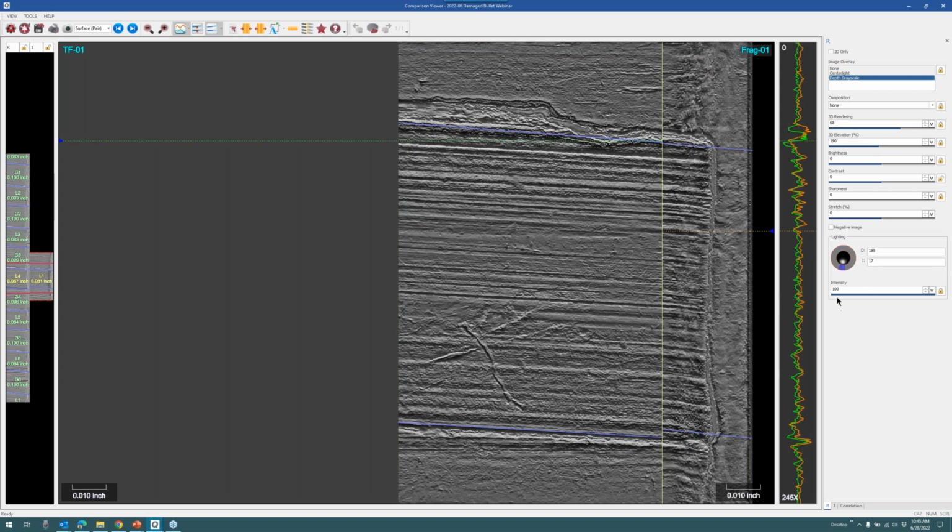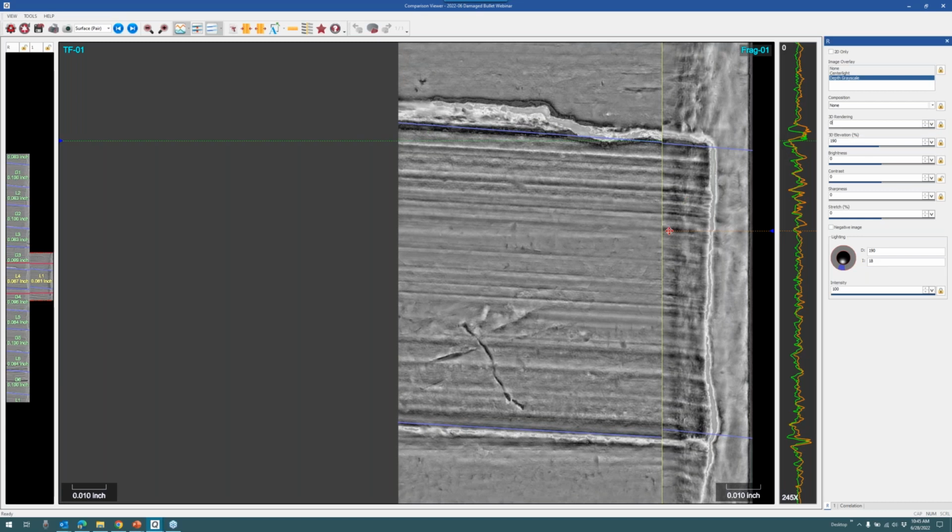see it. But when it comes down to how the system is working, if I go back to this 3D rendering tool here, bring it all the way back down to 0 for that raw depth grayscale view, everything it sees as far as that topography goes, it sees with pixel point precision in this image, because every pixel has a shade of gray in this grayscale view that is relevant to that topography. And so here, the computer is establishing this base image of 3D during the acquisition. And the automation of that process is meaning that it is consistent every time that it reads this surface.